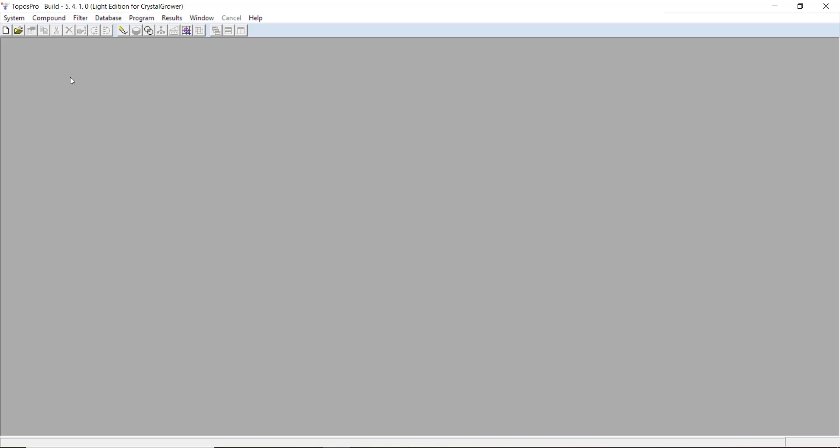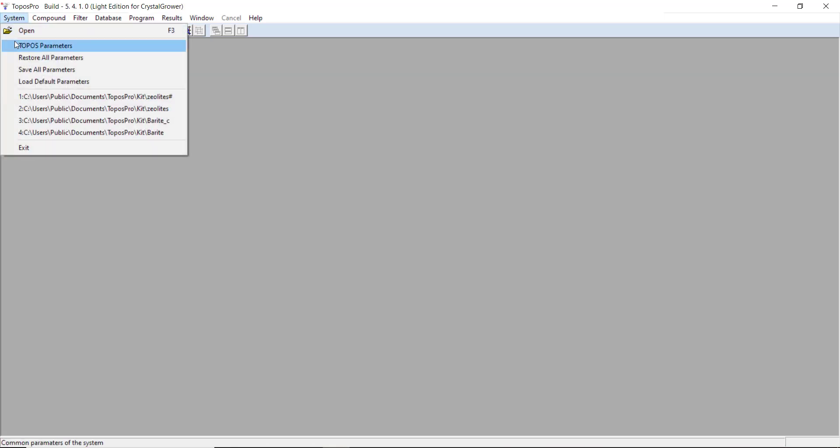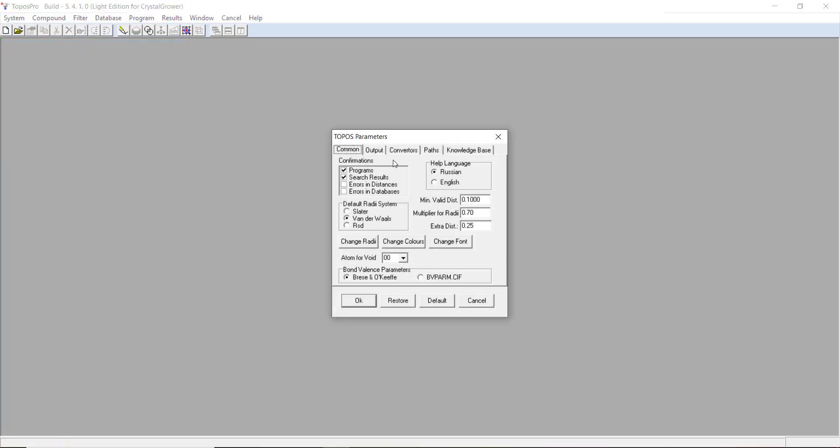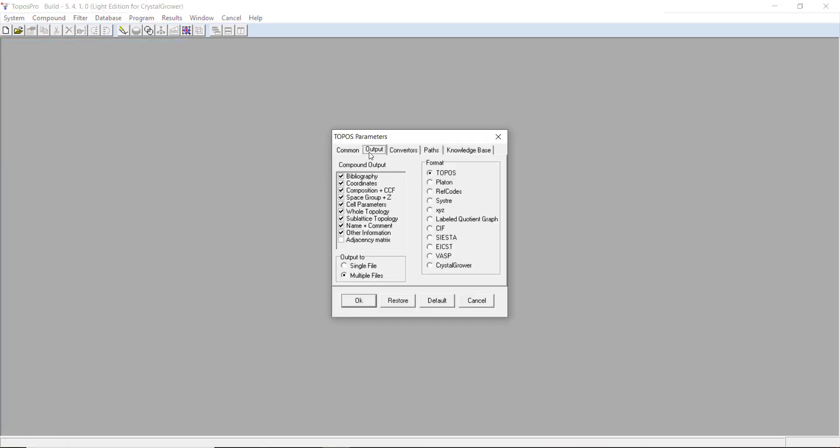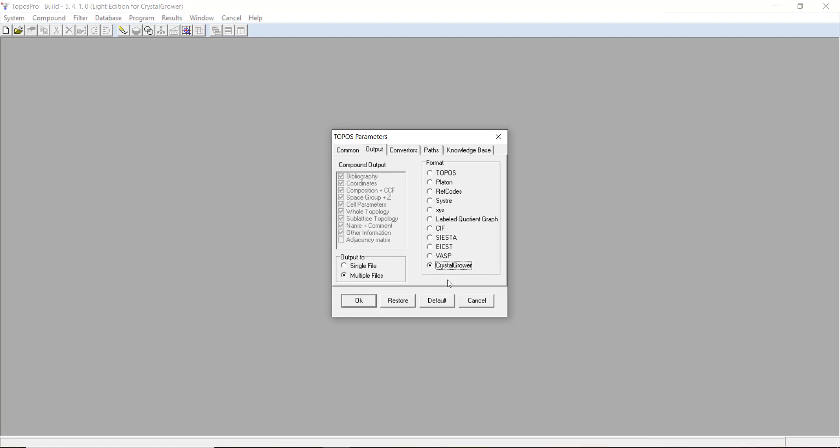The first thing we need to do is change the Topos parameters. If we go to System, Topos Parameters, and go to Output, we need to choose Crystal Grower as the output. You can also choose SIF or Topos, depending on what you need. But the other options are disabled in ToposPro Lite, as it's designed specifically to be used with Crystal Grower. You also want to have multiple files selected here as the output if you're doing any high throughput structure file generation.